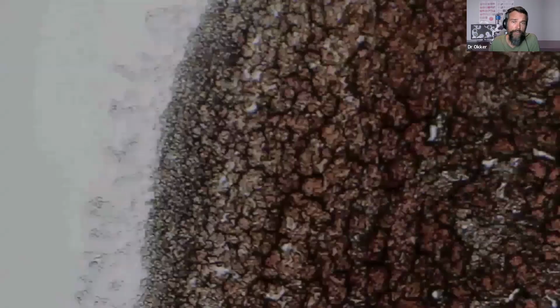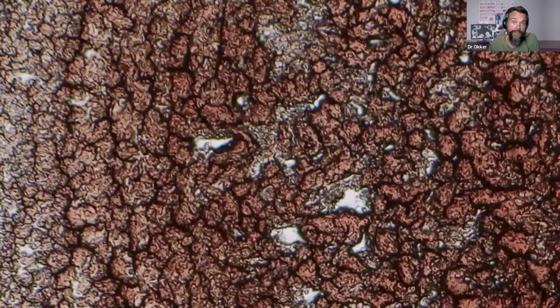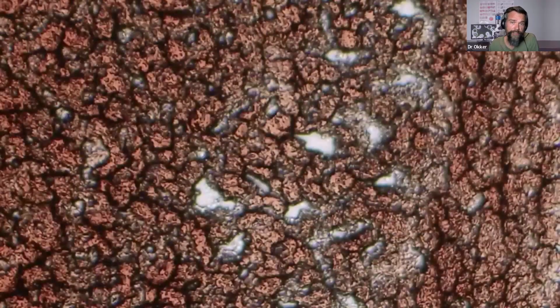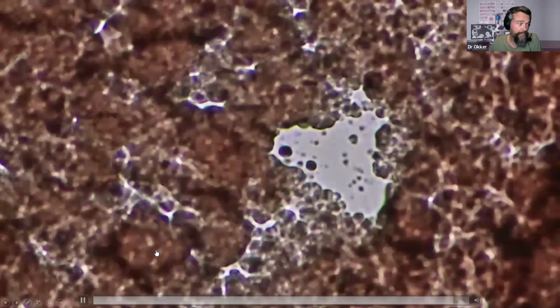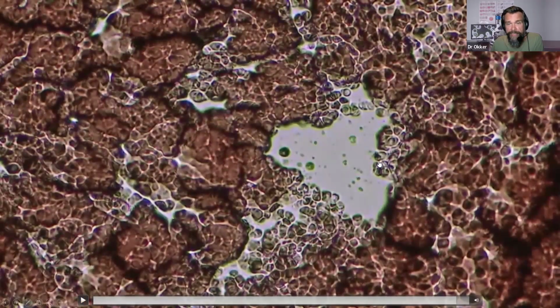So we see these patterns emerge long before conventional tests would show a raised blood sugar level, for instance. So also, again, here, when we see this, we take it quite seriously, and we start working with correcting blood sugar and managing blood sugar and insulin in these cases to prevent challenges with the blood sugar developing in the long term. The pattern on the screen there just relates to possible degenerative challenges.